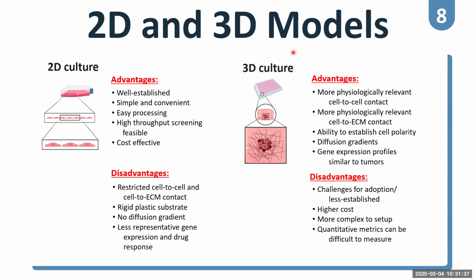Why has 3D cell culture become popular in the cancer research field? Because it gives more physiological cell-to-cell interaction and cell-to-ECM, extracellular matrix, interaction that does not occur in the monolayer of 2D cell culture. Also, the important point I want to point out is that it carries a gene expression profile that mimics the original tumor from the patient.